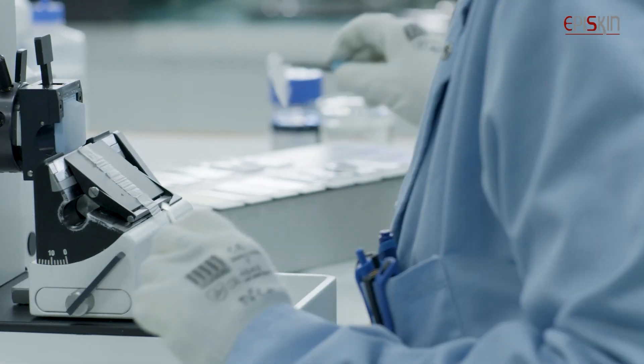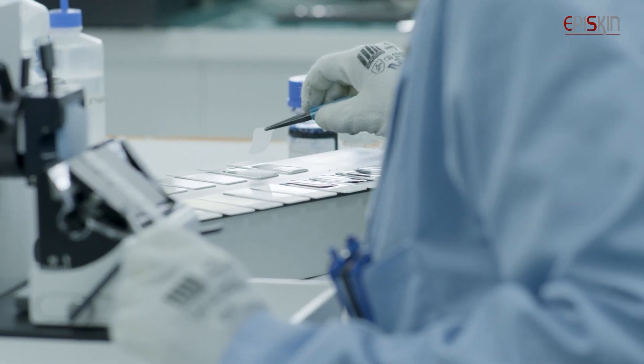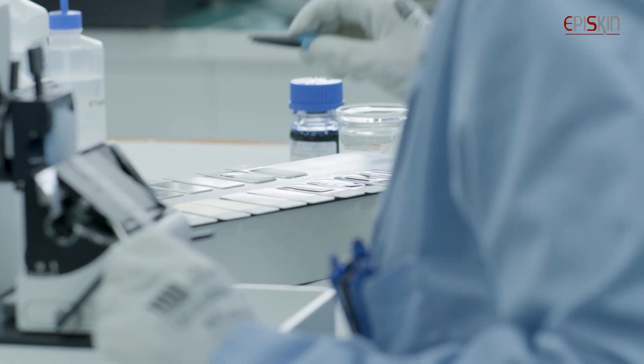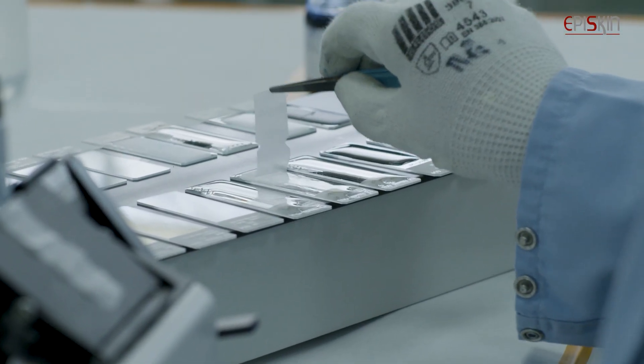At last, the effects of each active are analyzed with both closure kinetic, epidermal thickness, and histological tissue quality.